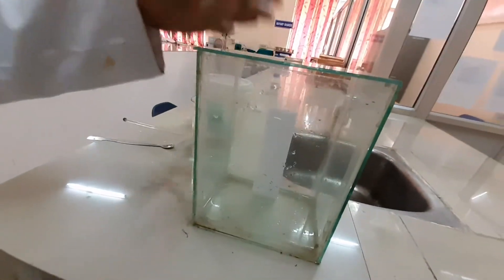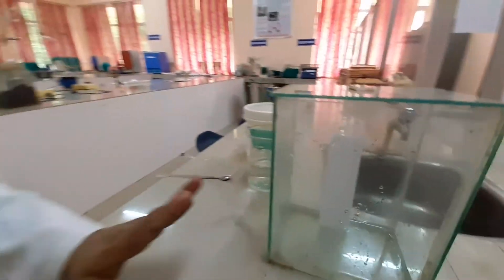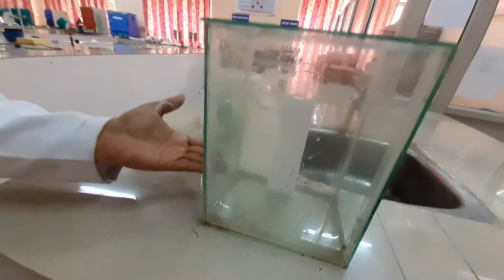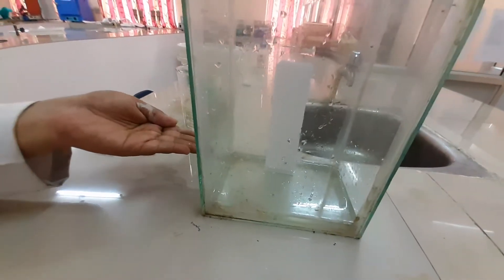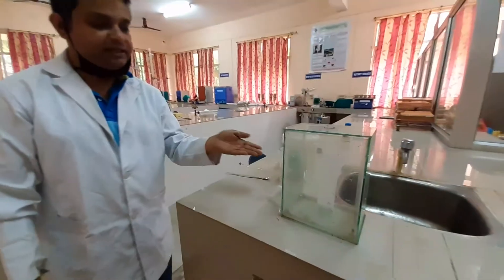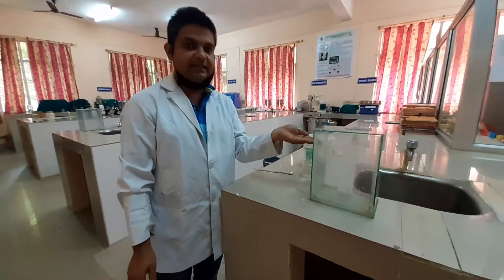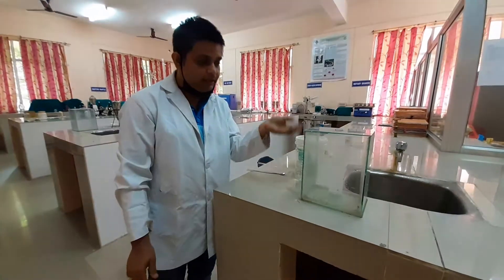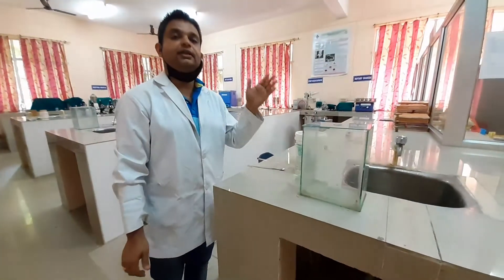Now just hold it, remove the lid, and slowly dip and place the plate. This is how you should keep your silica gel plate. You can see the solvent moving against gravitational force due to capillary action throughout the plate. After some time, when it reaches the 10-centimetre level that we have marked, take out the plate and calculate the RF value.